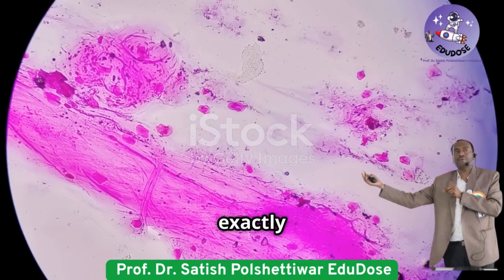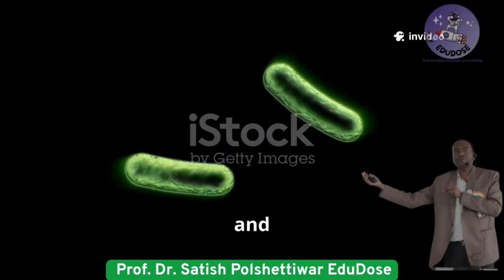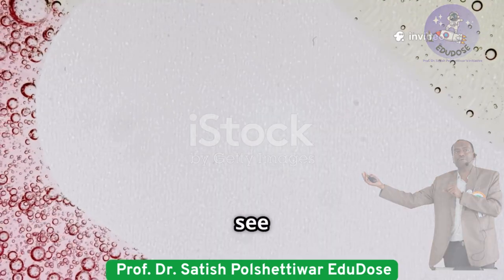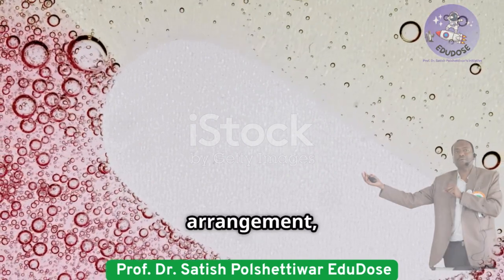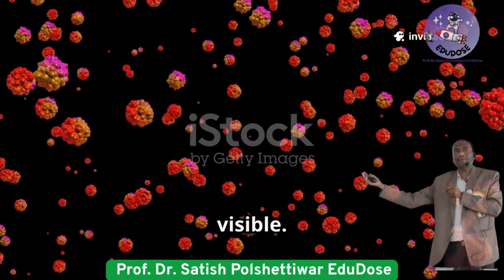So what exactly is bacterial staining? Bacteria are incredibly tiny and almost transparent under a regular microscope. To actually see them, we use special dyes to stain and highlight their size, shape, arrangement, and other features. Basically, staining makes the invisible visible.